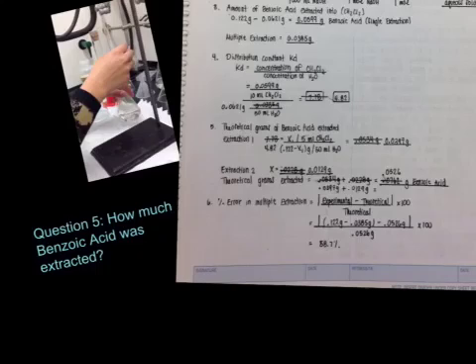Of benzoic acid originally used, and then we were able to get the amount of benzoic acid within the methylene chloride layer. And through this, we were able to calculate how much benzoic acid was actually extracted within each layer, giving us the KD, and then we were able to do the percent error in the multiple extraction to see how much we were actually able to extract.